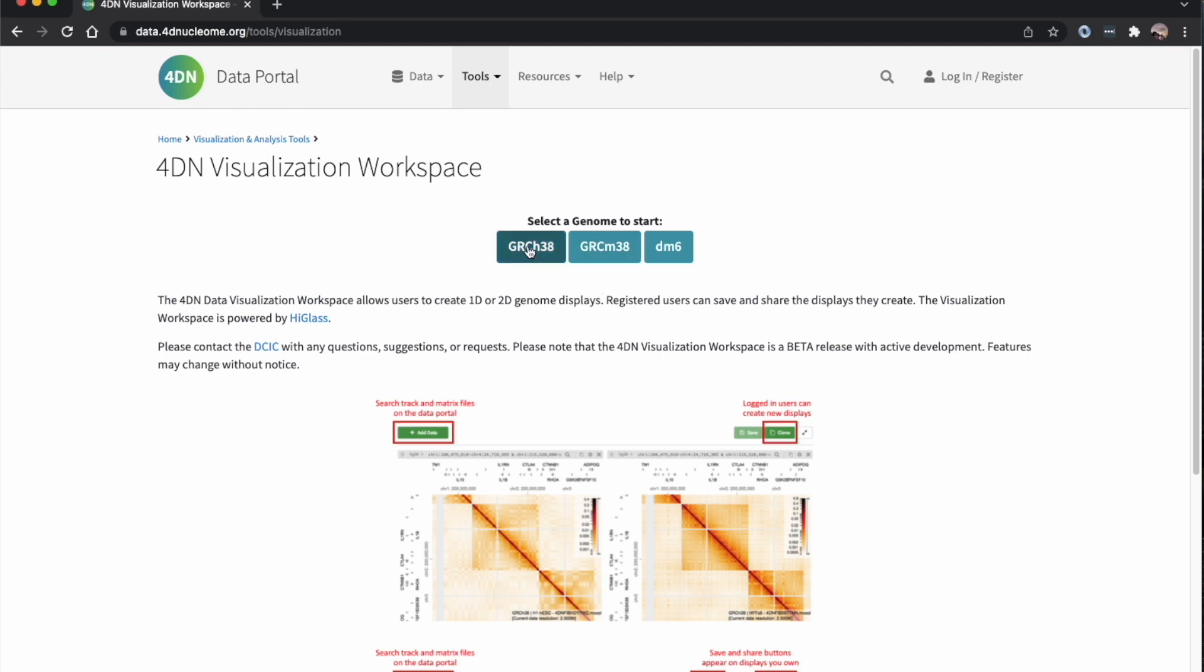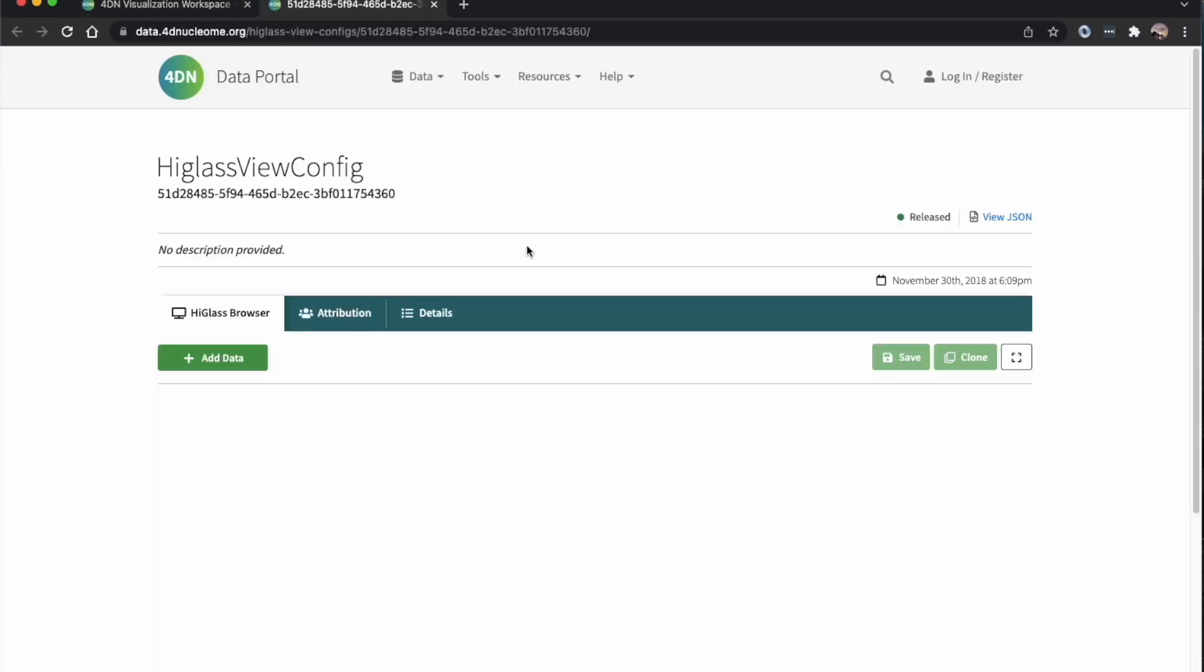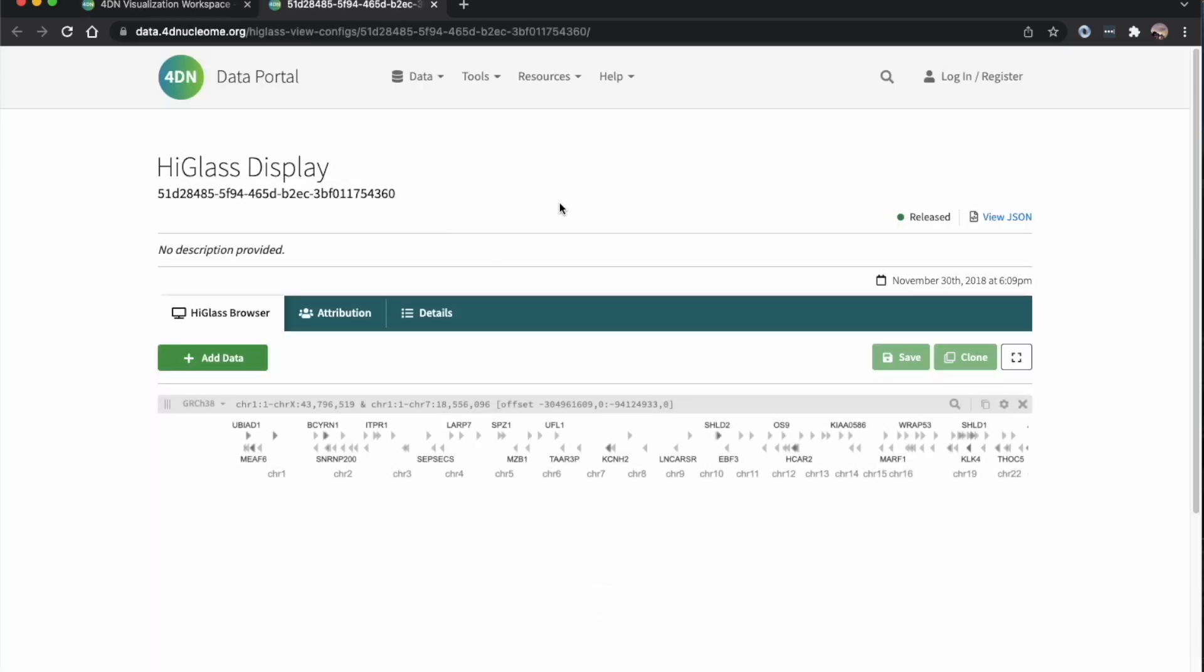To start with, we can pick an organism, so I'll pick human. Now we start with an empty HiGlass display.